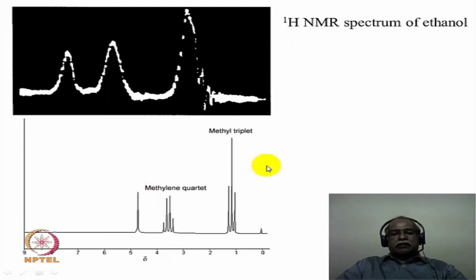So, to summarize, in this particular lecture, we have looked at what is an NMR phenomenon, how NMR spectroscopy was developed from that phenomenon, and what is the basic principle behind NMR spectroscopy. These are the things that we have covered in this particular lecture.